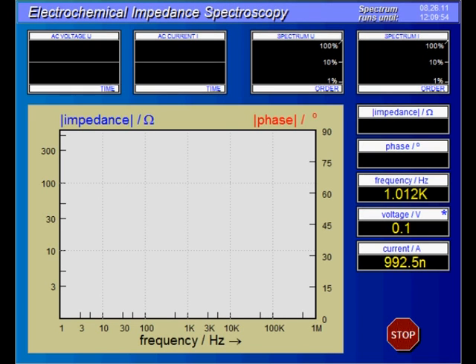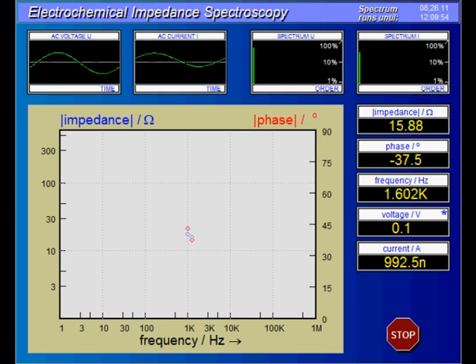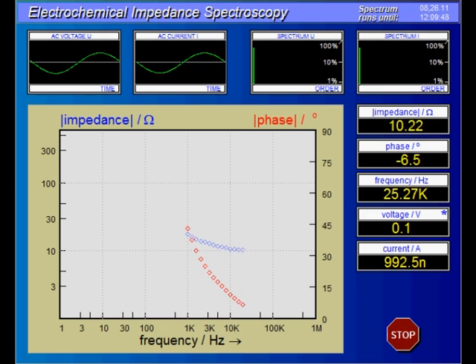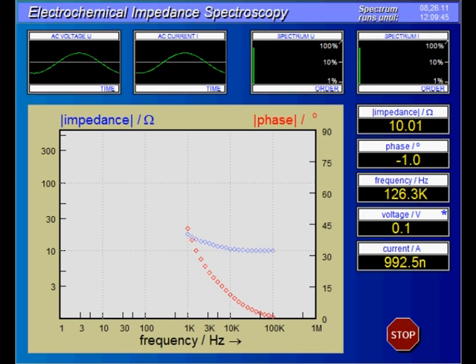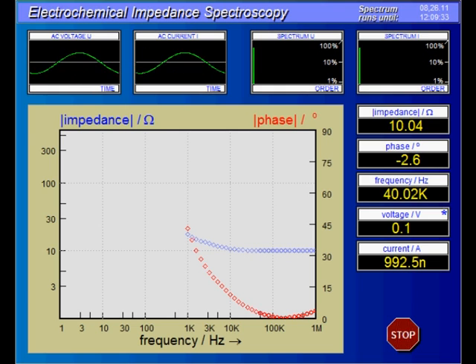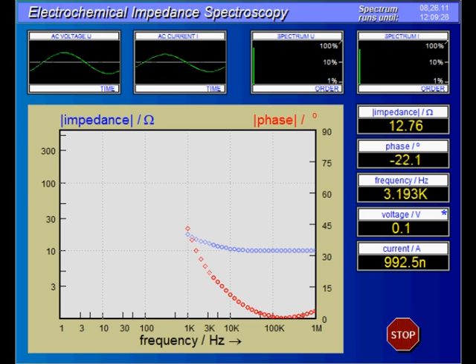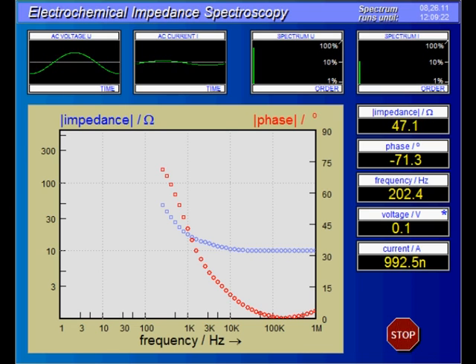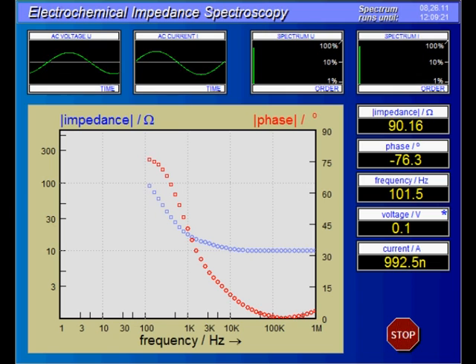The display changes to the real-time recording window. The big graph shows the progress of the sweep. The four smaller graphs on the top show voltage and current signals in the time domain and in the frequency domain — same as in the control potentiostat window, you can easily see noise and disturbances there. The DC values of each measurement point are shown on the right-hand side, and the asterisk informs you of the DC mode: potentiostatic or galvanostatic.